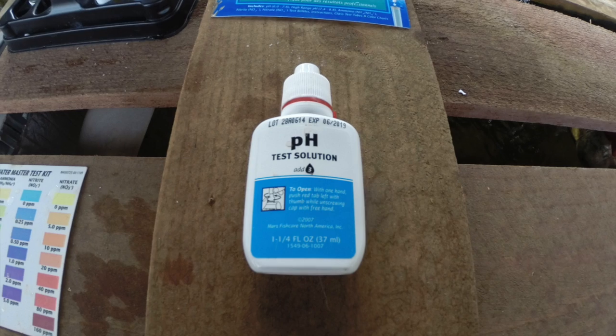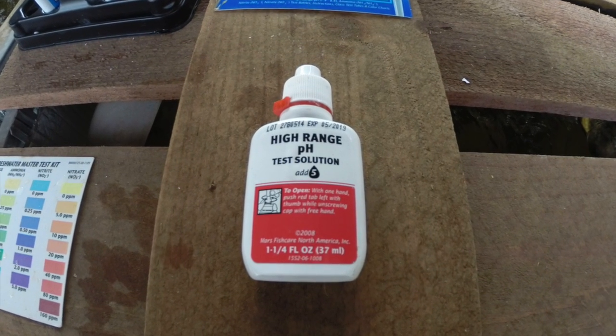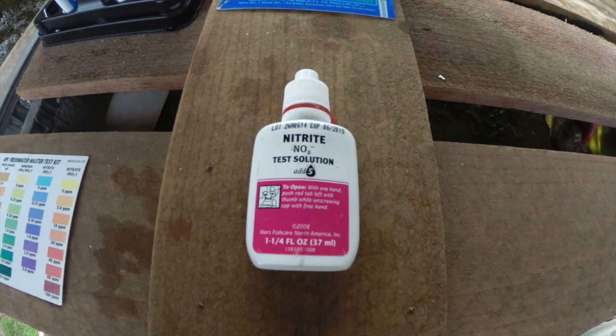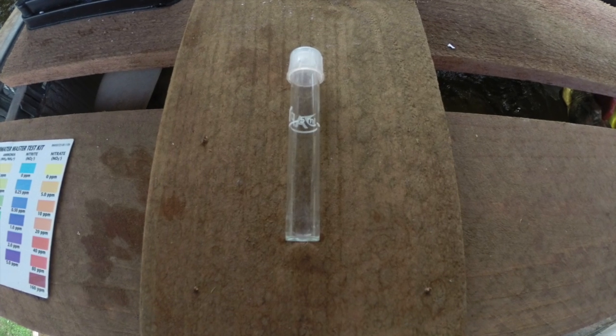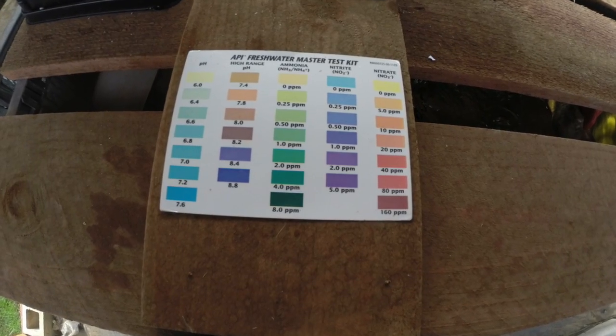We have your pH test solution, high-range pH, ammonia, nitrite, and nitrate. We also have four test vials and a color chart.